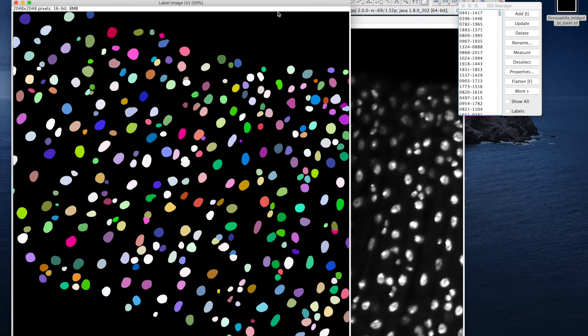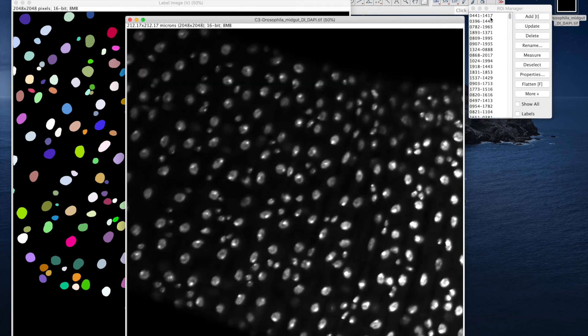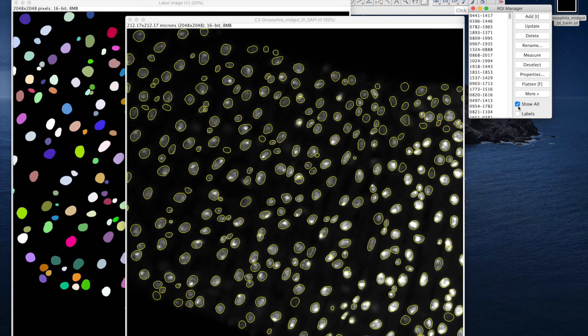All of the labels are in ROI manager and they are available as regions. So you can superimpose those regions to the input image.